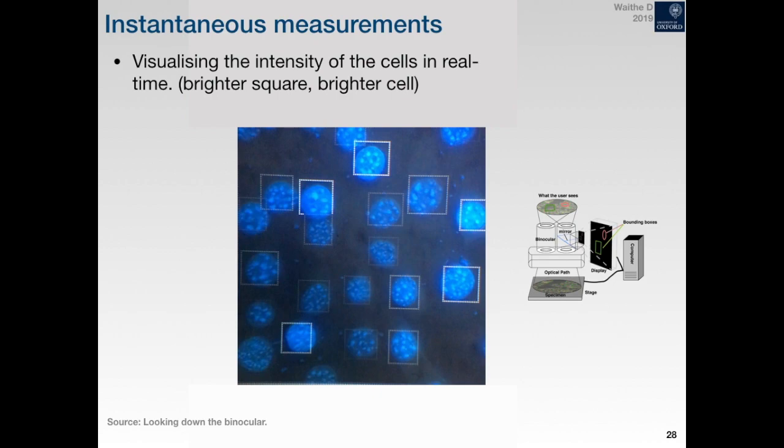It can handle remarkable things. I'd say their ability to abstractly recognize features is better than a human. You can't explain some of the things it's able to recognize mathematically, for example, and that is part of the amazing thing about deep learning, that you don't anymore have to choose the features yourself. This is more shallow machine learning, the conventional approach, where you would choose your features and then learn to classify based on that very rich numerical description. Now with deep learning, you go straight from the raw image to what you're trying to do, and it learns everything in between.